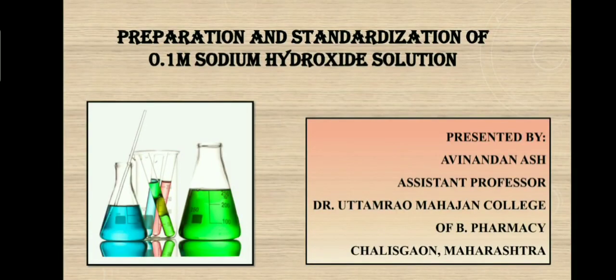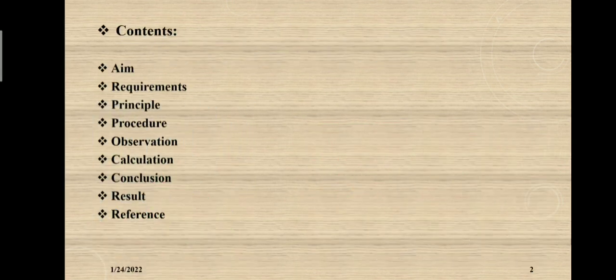Myself Abhinandan Nas. I want to present about the preparation and the standardization of 0.1 molar sodium hydroxide solution. In this topic, I will discuss the preparation methods and the standardization of 0.1 molar sodium hydroxide solution, how to prepare and how to standardize. First, these are the contents I want to discuss in this topic.